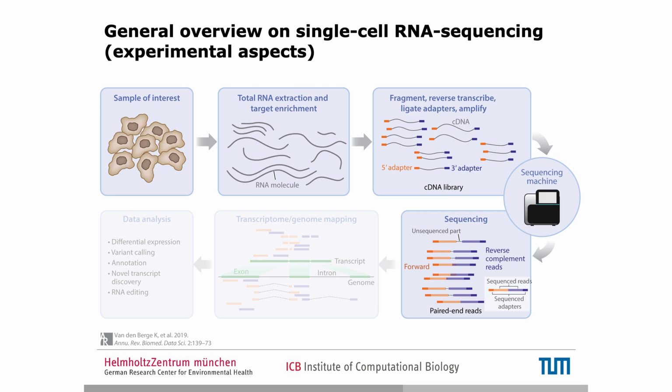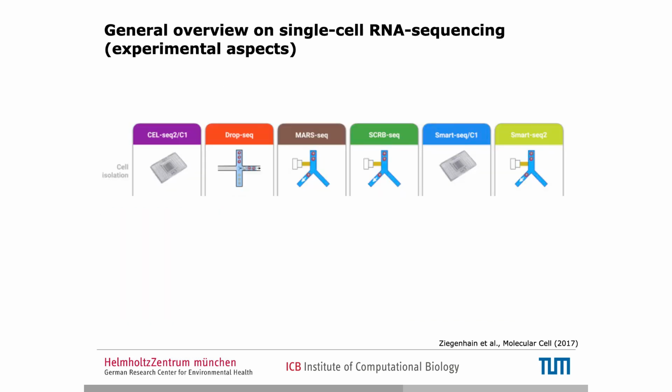So this is the experimental part, and in the end we will only focus on the data analysis part, but I would also like to cover a bit on the genome mapping, at least theoretically.